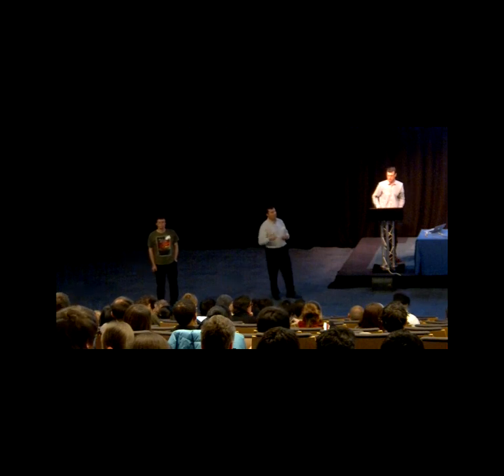But I mean, that's really the holy grail of this setup, if we can hit the things which don't have the identical domains in the database, but still come up with smaller fragments. Could be potentially then extended by SHELX, etc. So that would be really neat. But we'll look at those cases. Maybe in the paper we'll let you know what was the success rate or which cases worked.